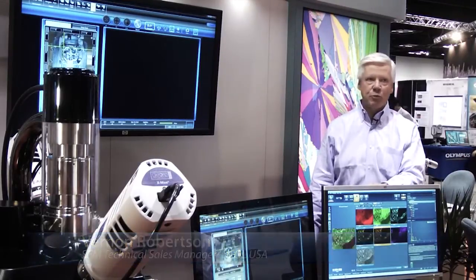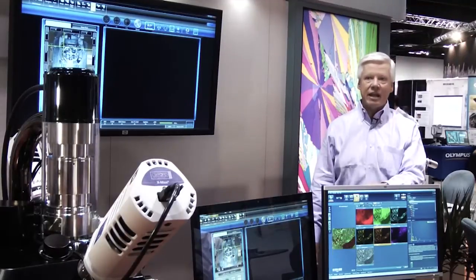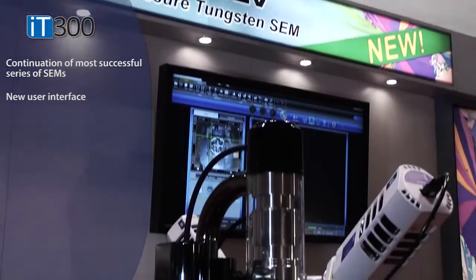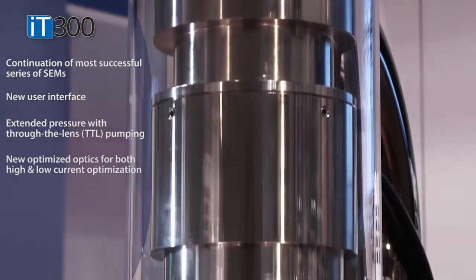My name is Vern Robertson, I'm with JEOL. JEOL is delighted to introduce to the world our newest workhorse scanning electron microscope — the legacy of the 5800, started in 1994 when JEOL introduced the first large-chambered automated low-vacuum microscope. Many generations later, this is the continuing legacy of JEOL's development in the SEM world. We've redesigned the specimen chamber.